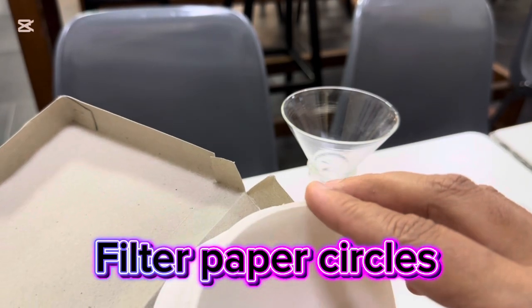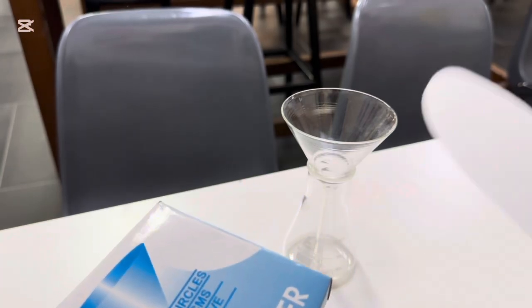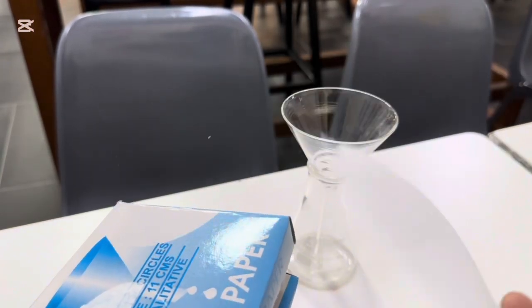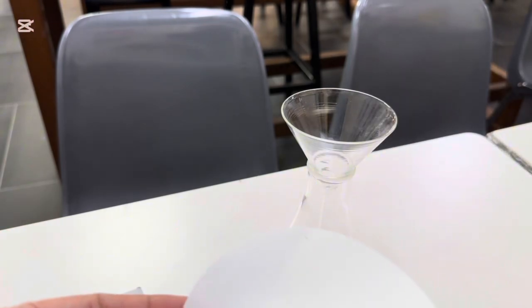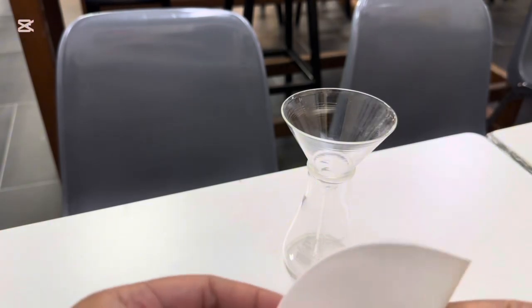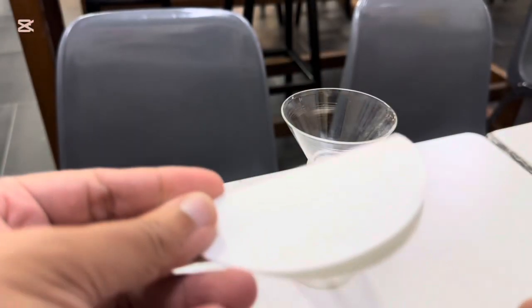Here is a box of filter paper. I didn't quite know this until I started the video, but these are called circles. Now, I know that sounds daft, but it's actually circle as a noun. So you get a circle of filter paper. So there you go, something new for you. What you need to do is place the filter paper within the funnel.